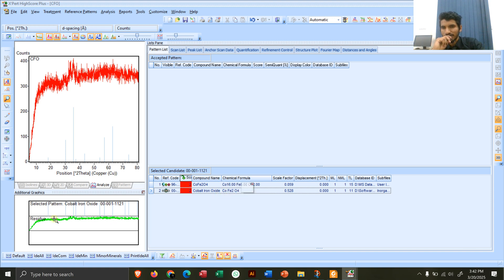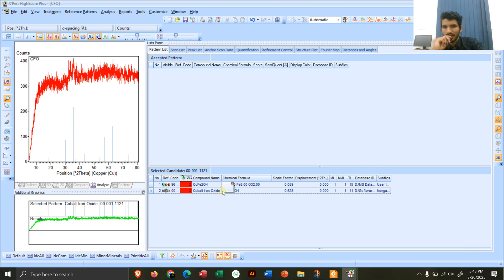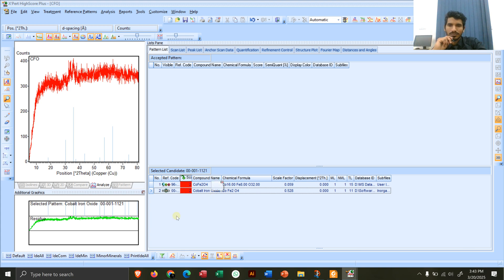Looking at cobalt ferrite (CoFe2O4), here is our own XRD pattern and these are the reference peaks. You can see this peak matches this one and this peak matches this one. The green is our own XRD and the blue lines are the reference pattern. Several peaks are matching — this one, this one, this one — but the cobalt ferrite peaks are not very intensive. The score is very low, indicating it is present in small quantity with only a few peaks matching.